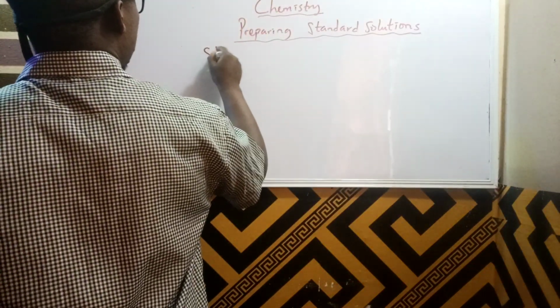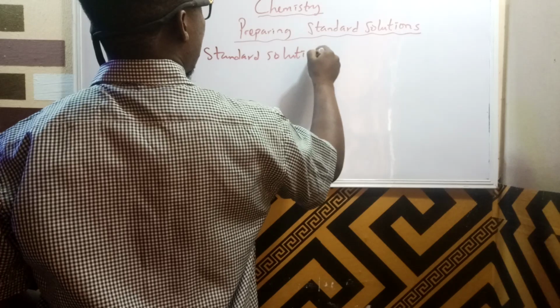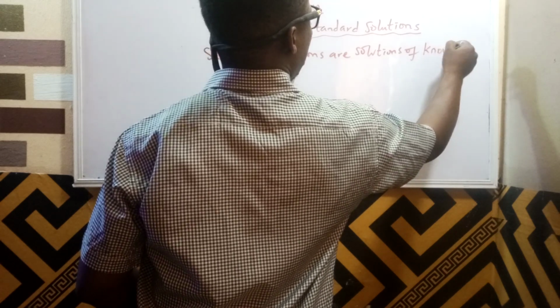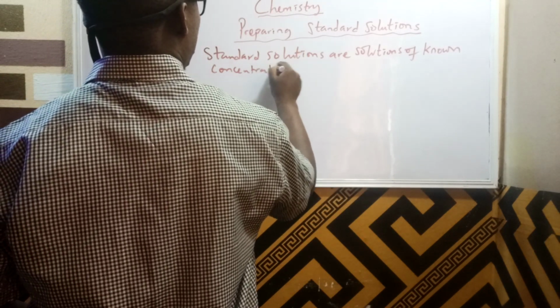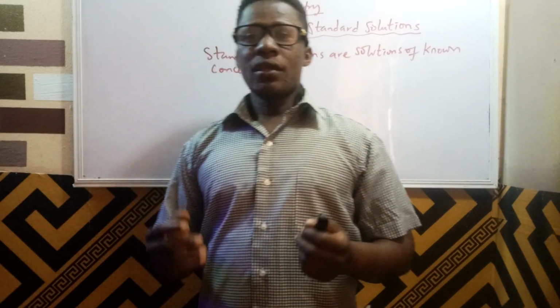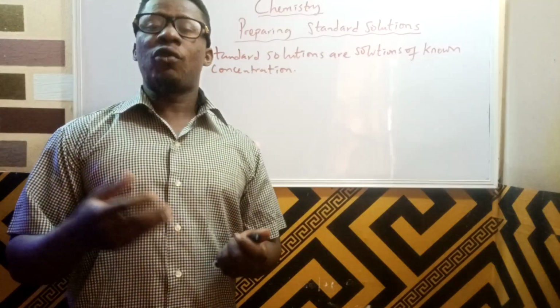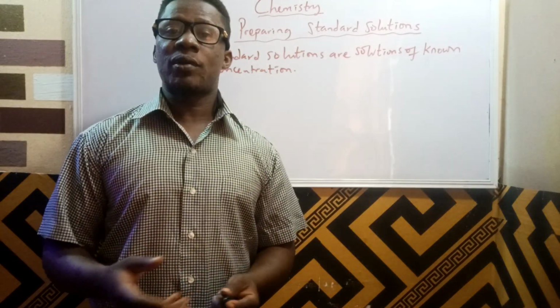Standard solutions are solutions of known concentration. Now, of course, for standard solution, it is expected that we follow some steps when we are preparing standard solution.